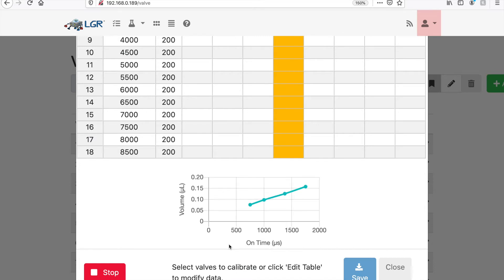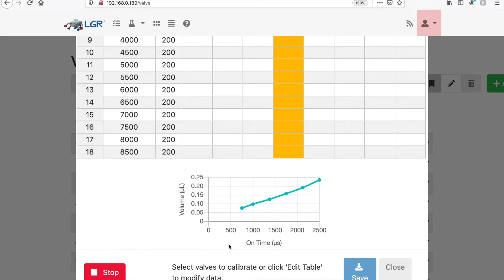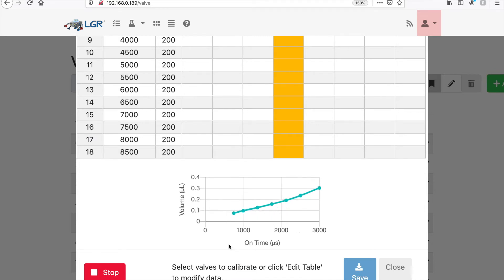The calibration station uses precision scale to calibrate valves over a wide volume range.